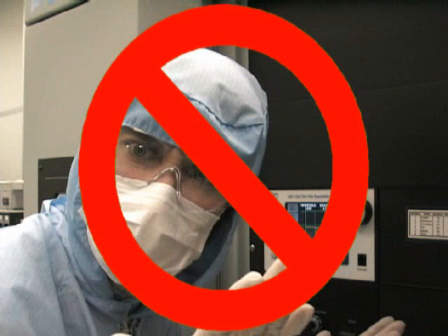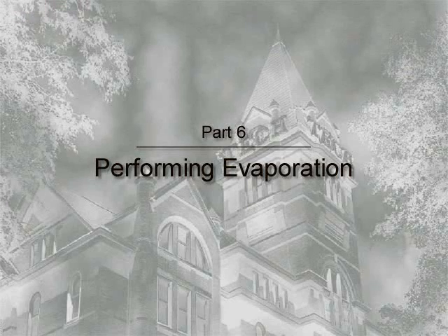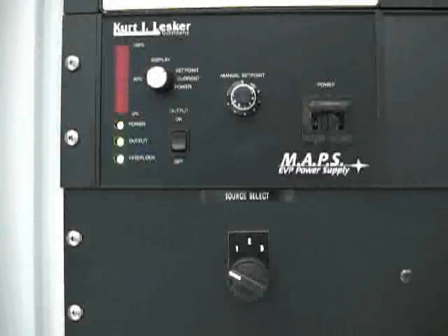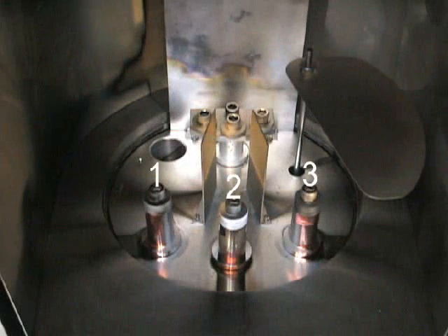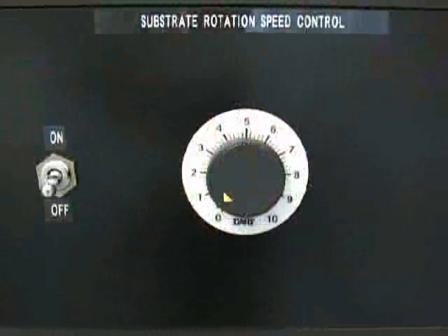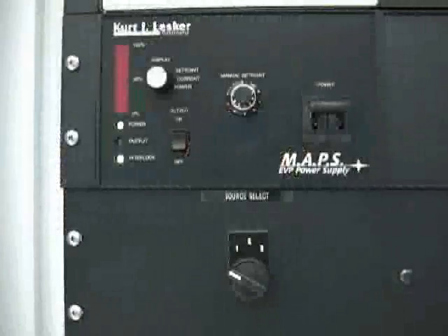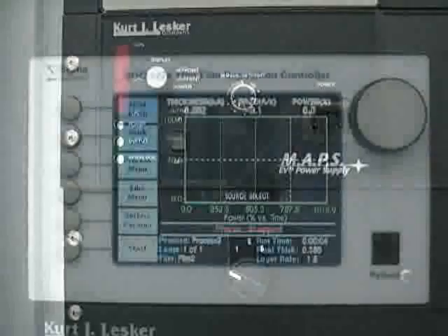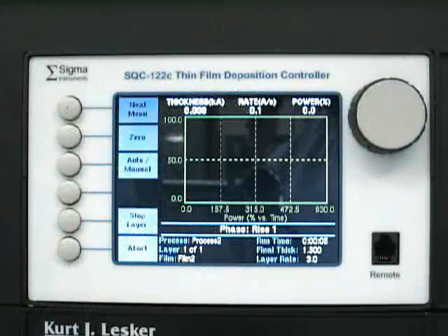The control screen for the deposition monitor is not a touchscreen — do not press it as if it were one, as the screen could be damaged over time. To begin performing evaporation, set the source selector to the electrode pair that the tungsten boat is connected to. The numbers 1, 2, and 3 indicate the electrode pairs from your left to right. If you wish to use the substrate rotation feature, set the desired rotation speed on the substrate rotation speed control dial and then turn the rotation power switch to on. When the chamber has reached the desired pressure, turn the output power switch to on. When you are ready to begin deposition, press the start button on the deposition controller. This will initiate the deposition process and handle each aspect, from ramping up source power to opening and closing the shutter automatically.